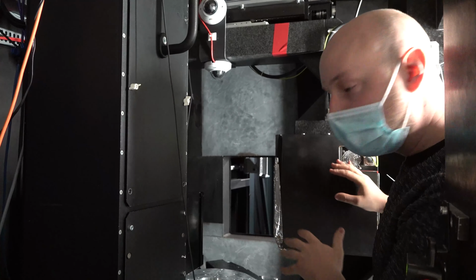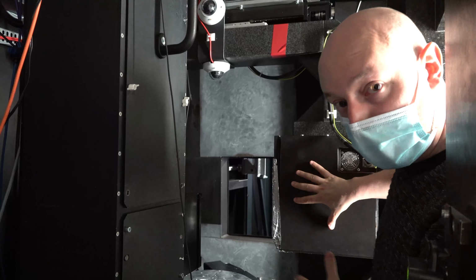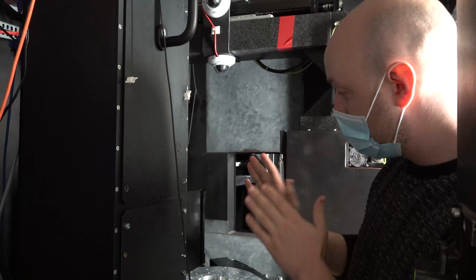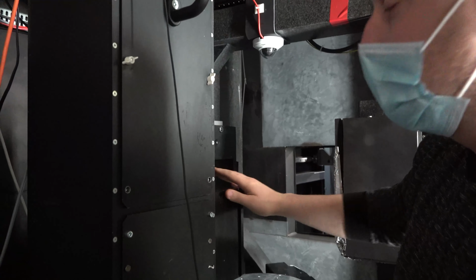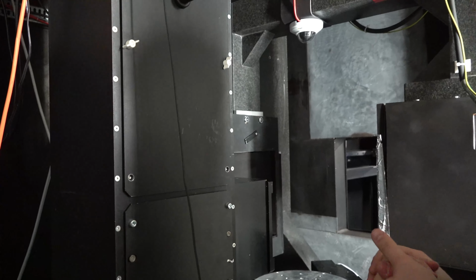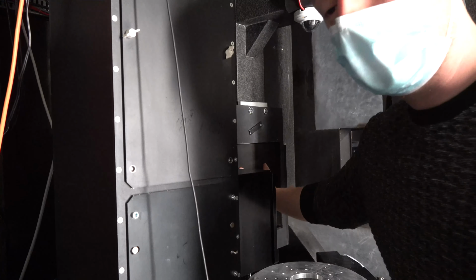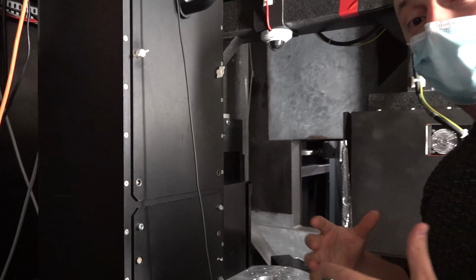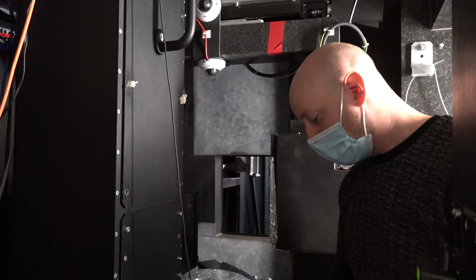Now, to the X-rays. This is the X-ray generator. It's an X-ray microfocus source. It will project the X-rays against the sample. As you can see, they are at about 90 degrees from one another and will be captured by this detector. Now, it is possible in this instrument to capture the two of them at the same time.